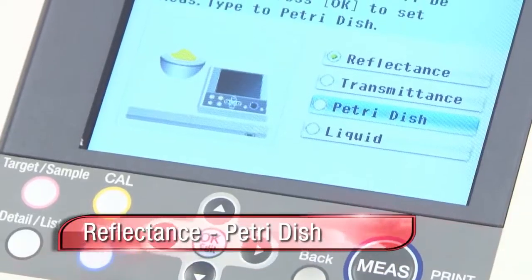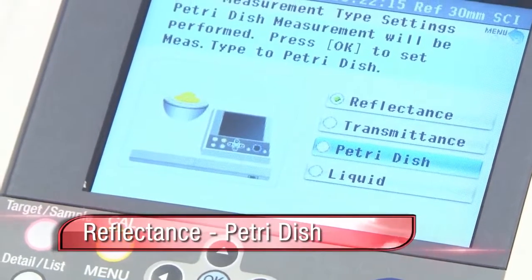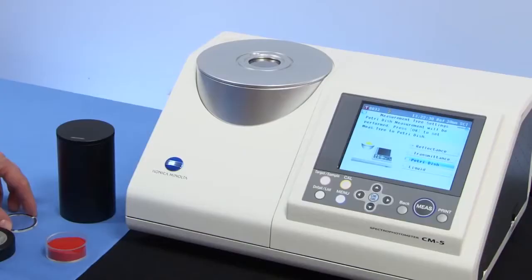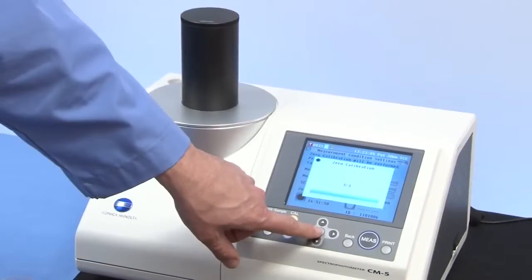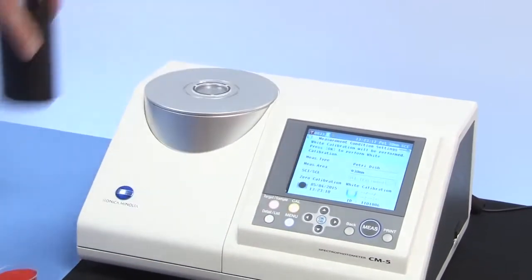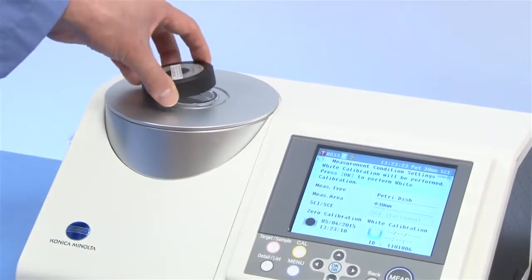To perform a reflectance measurement in petri dish mode, put the special target mask in place followed by the glass accessory piece. Perform zero calibration and then an external white calibration through the glass piece.